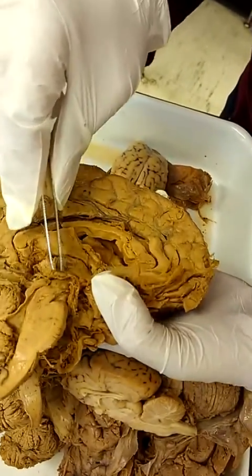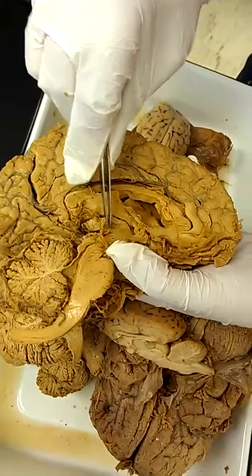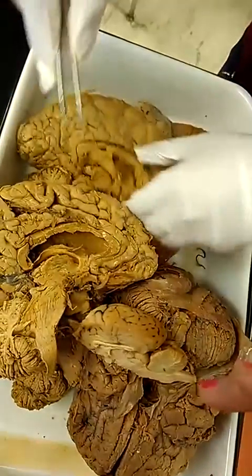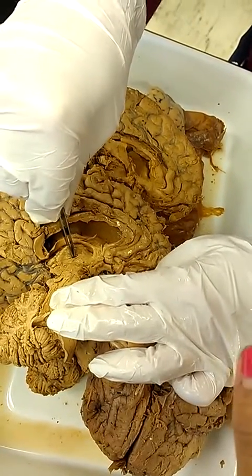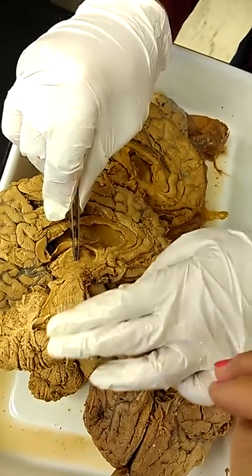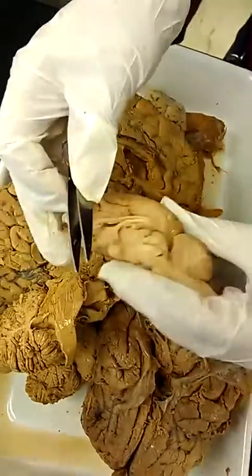Okay, so then I think right here is the thalamus. It's the very wrinkly part, and it's the wall of the third ventricle, which should be right here. The ventricle should be right here, from first and second, third. And then the fourth ventricle opens up at the cerebral aqueduct, which is easier to see.